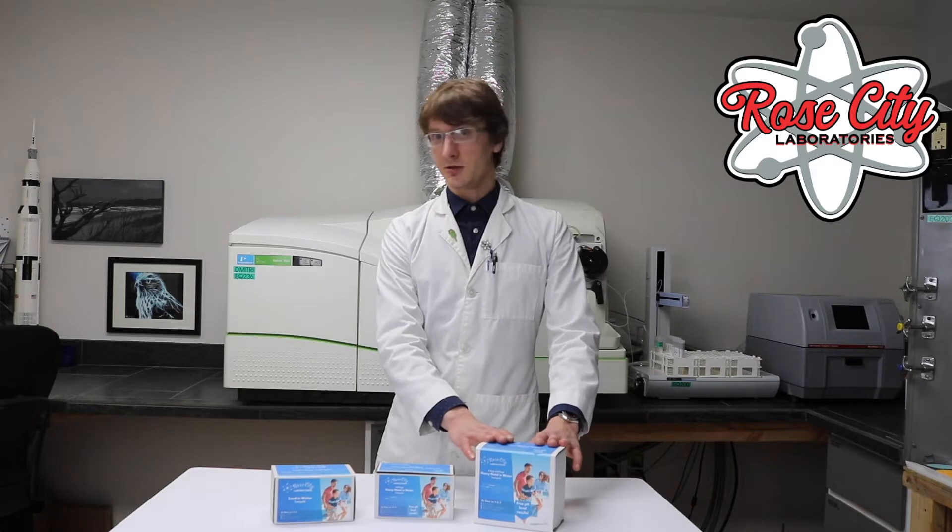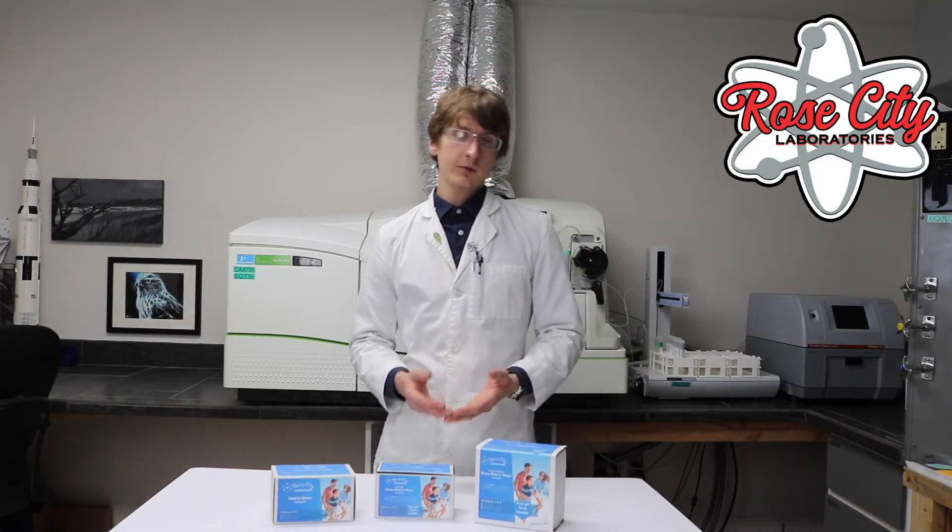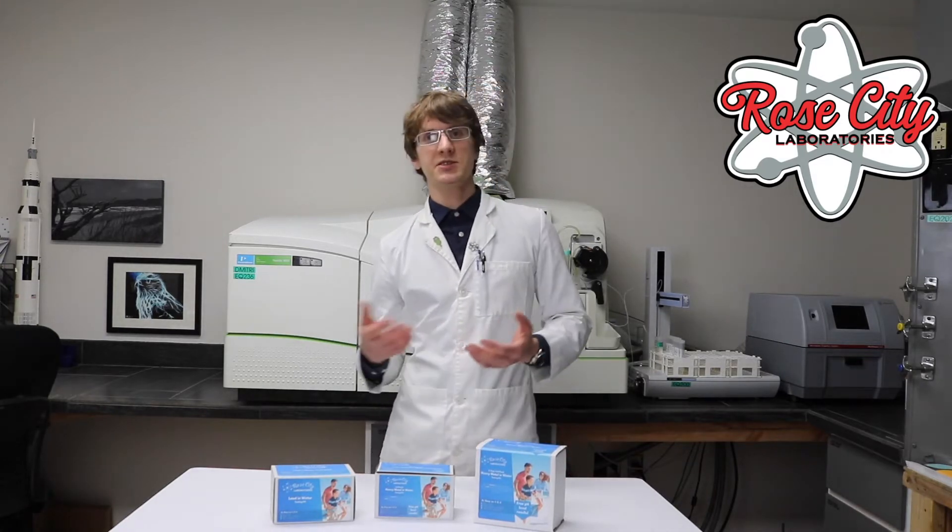You can pick these kits up either at our lab or purchase them online. Either way, you send it back into the lab and we test the samples here.